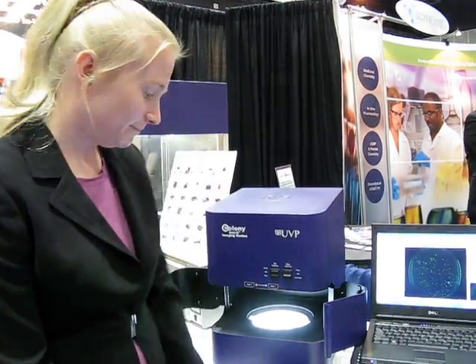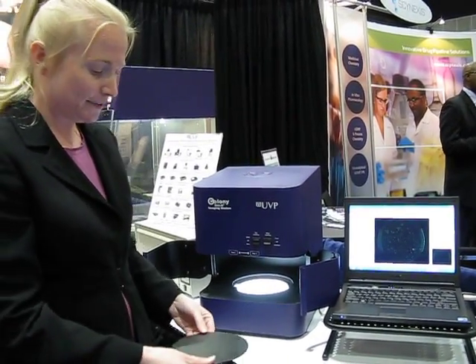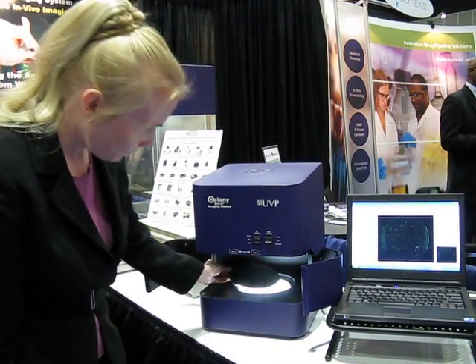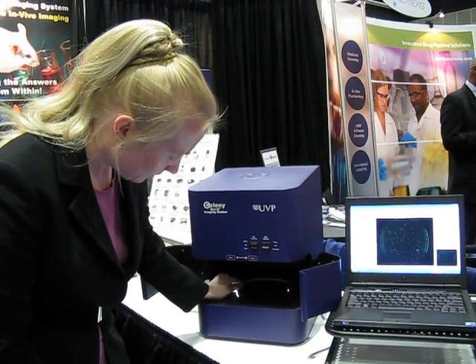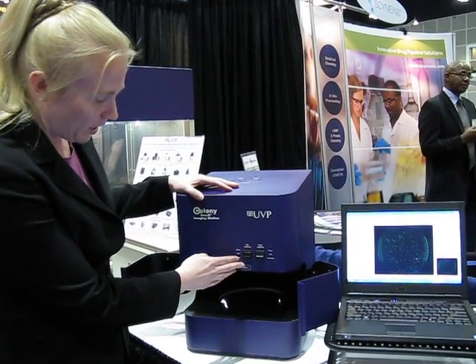I'm going to show you a little bit about how to capture the image and then analyze that image. So the first thing that you want to do if you're doing GFP colonies is you want to put this plate in.